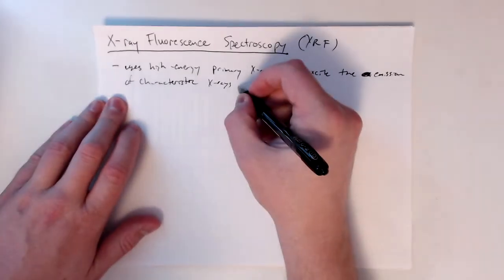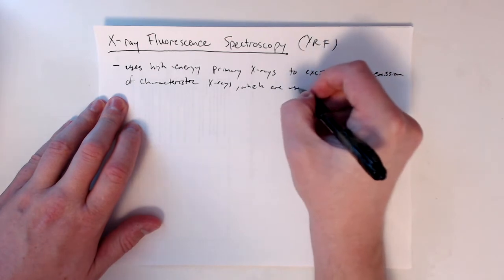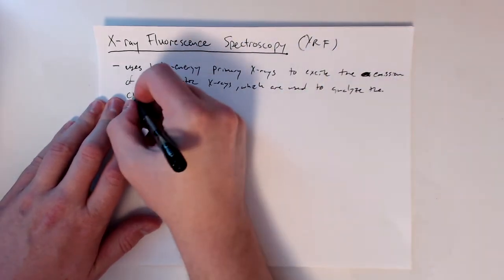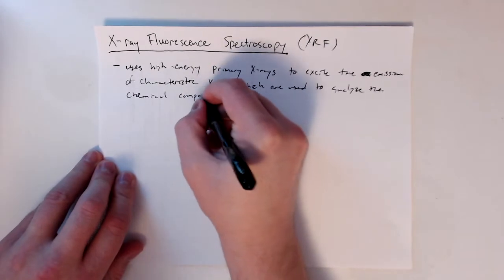And so it uses those characteristic X-rays to analyze the chemical makeup, or composition.